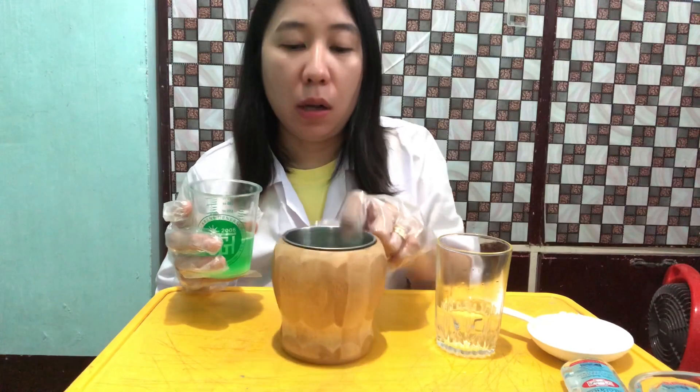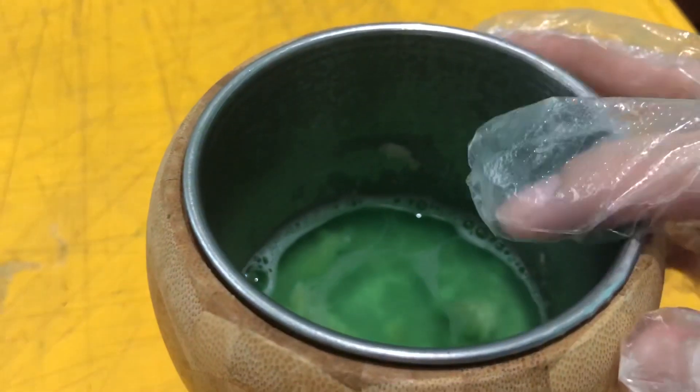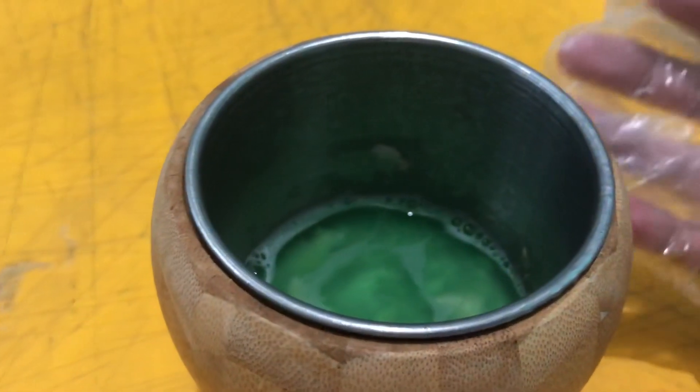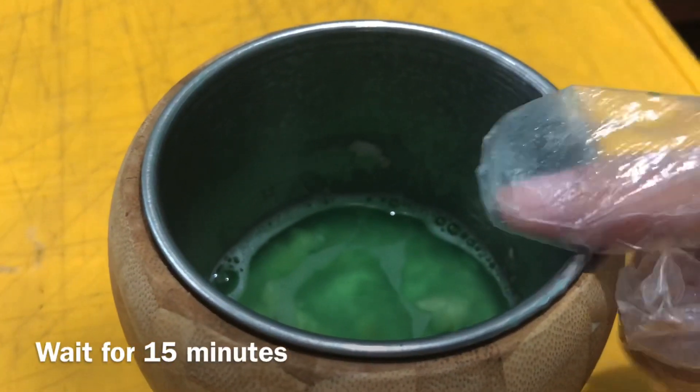The main purpose of our buffer is to open up the banana cells so that we can extract the DNA. We're going to wait for 15 minutes for our banana to be completely soaked in the buffer solution.